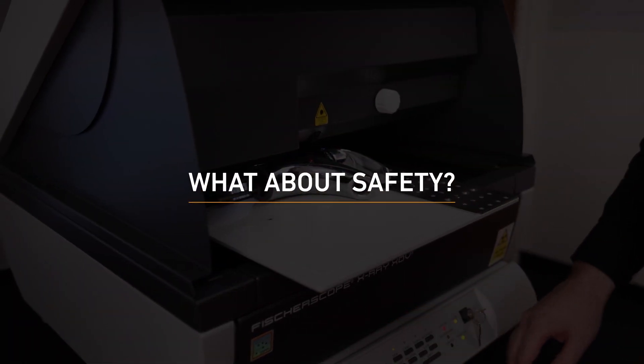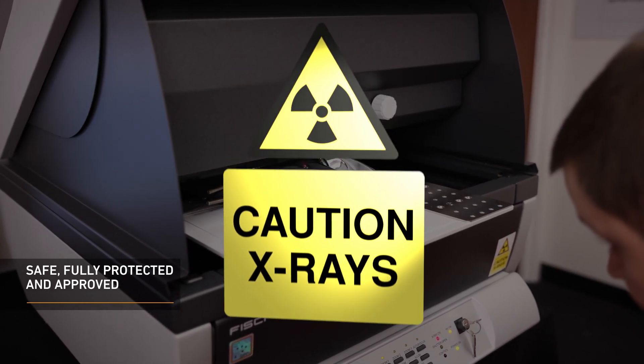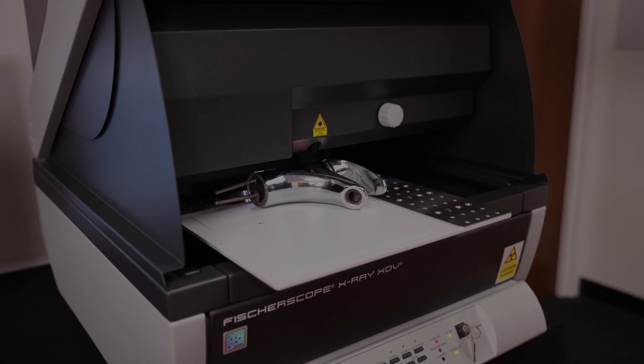Safety is of the utmost importance to us and our customers. As such, the FischerScope X-Ray XDV-SDD is a fully protected instrument with type approval according to current radiation protection legislation.